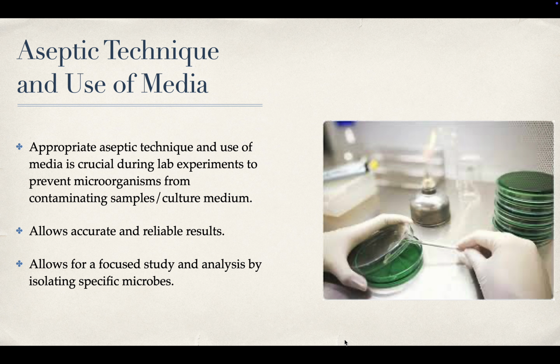Aseptic technique and use of media. Appropriate aseptic technique and use of media is crucial during lab experiments to prevent microorganisms from contaminating samples and culture medium. It also allows for reliable and accurate results, allows for a focused study and analysis by isolating specific microbes.